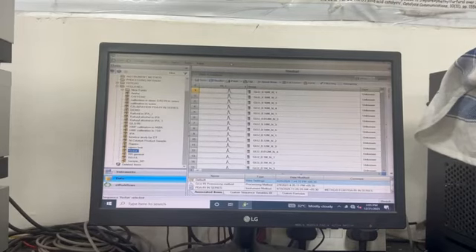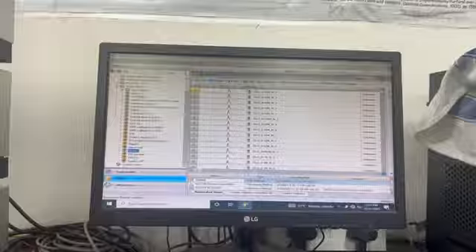Okay, so next we will see there are three main things actually. We can consider 3 to 4. One is the instrument method, so we give the instrument a method so that it can use that method when it analyzes our sample. The other one is the processing method, so based on the instrument method, the sample will be processed. So what is that processing method we will give it?